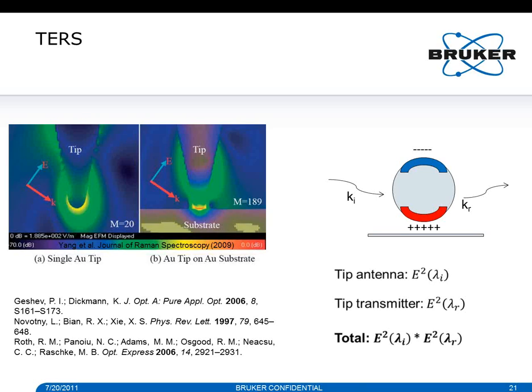Silver has the additional advantage of giving a slightly higher signal enhancement, but it has the disadvantage of being silver, meaning that it degrades quite quickly. It oxidizes, perhaps from sulfur, it's not exactly clear what happens in a short time on a silver tip, but it is clear that it degrades quite quickly, whereas gold is way more stable.